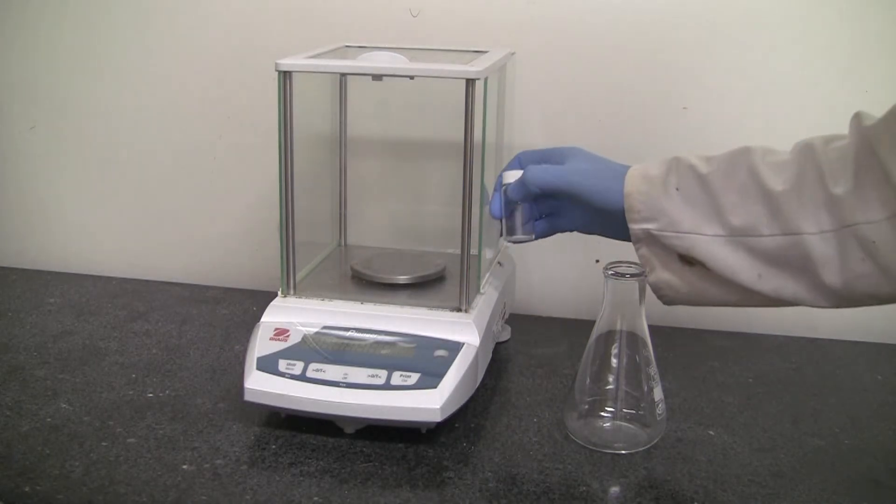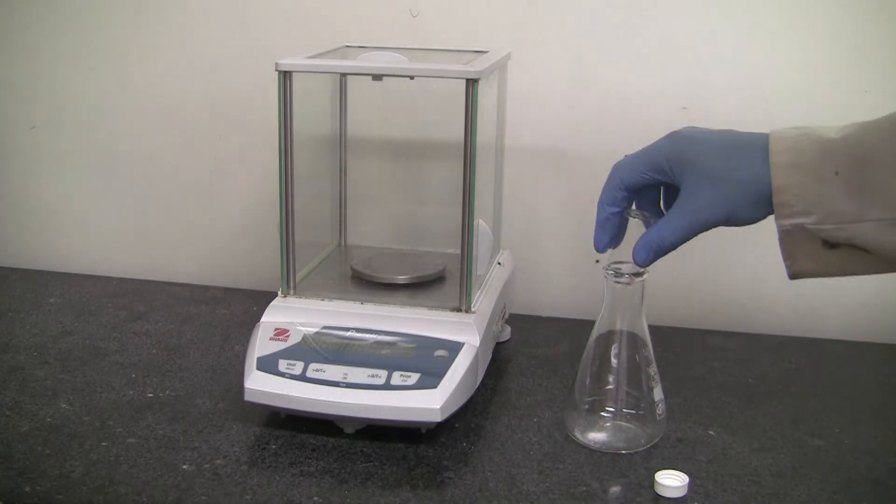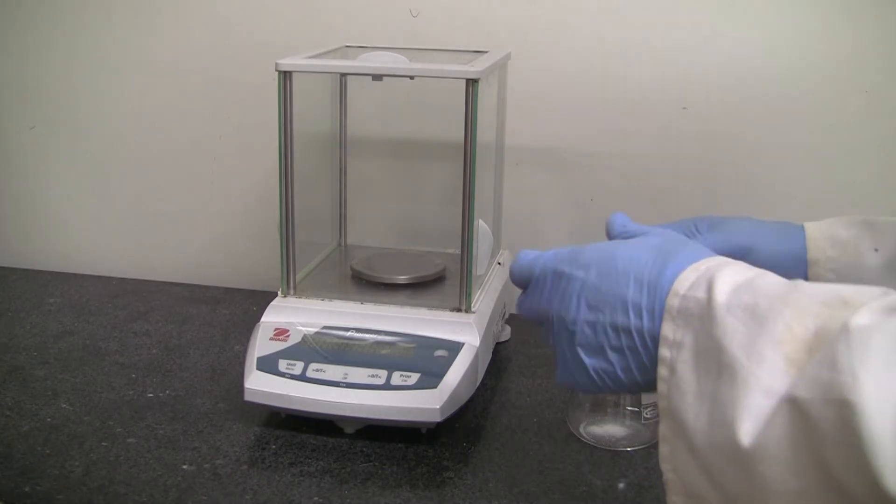Take your sample out and carefully transfer it into the flask you're going to be working with. Make sure you don't lose any on the transfer. Pop the lid back on—there'll still be a little residue left in your vial, that's fine.